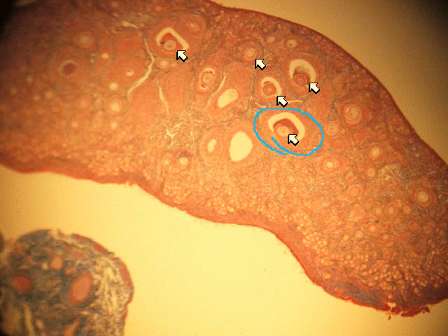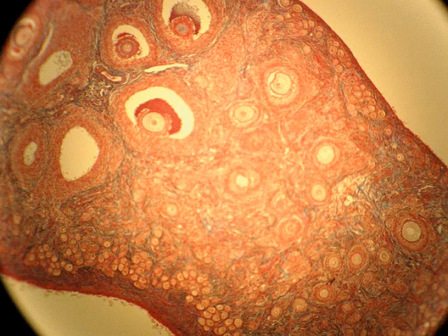For lab, you need to recognize that this is a maturing follicle, what you see drawn in blue or circled in blue, and that cell in the center there is the secondary oocyte, or for lab, you can call it the ovum, O-V-U-M. Now, if we move to another slide, here you're seeing the same slide on a higher power, and so it's a lot easier to see all the very numerous primordial follicles. And then you see a few maturing follicles right here.